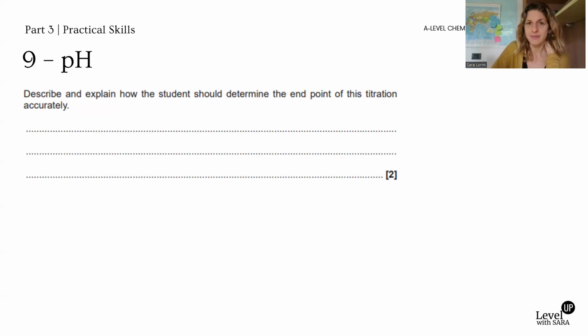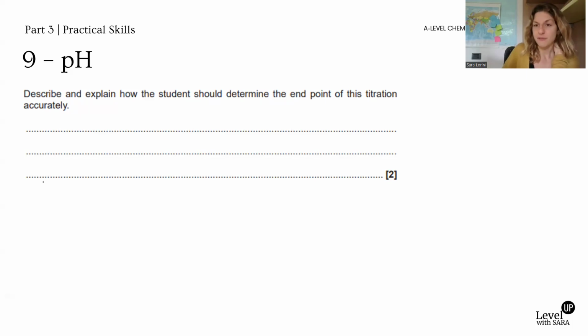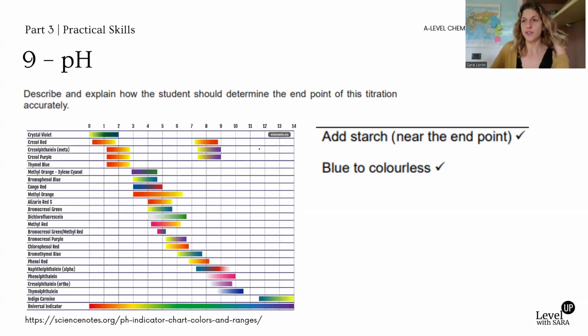So this titration is a quite specific one, and involves the reaction releasing iodide ions in the conical flask. So there will be iodine that will result in a change in color. And as we know, when iodine is present, there is one indicator that is very important, and that is starch. In fact, for this titration, and you may remember it as always the thiosulfate and iodine titration, you would add starch near the endpoint because the change will be blue to colorless. Anyway, this was specific and I didn't give you the overview.